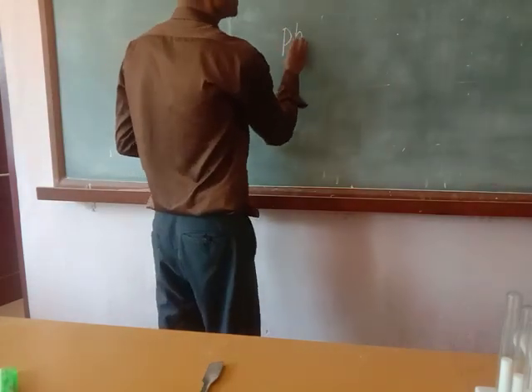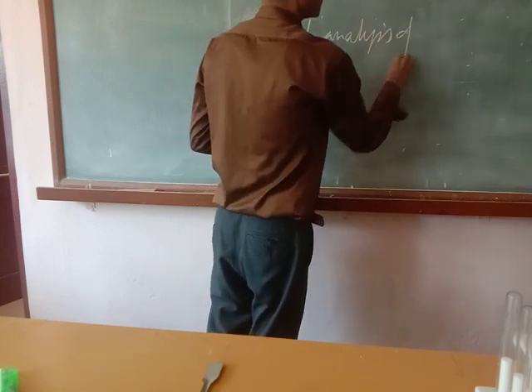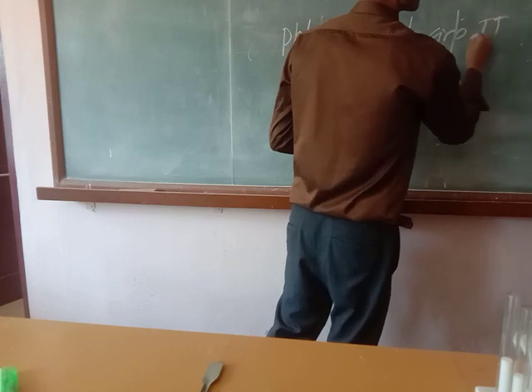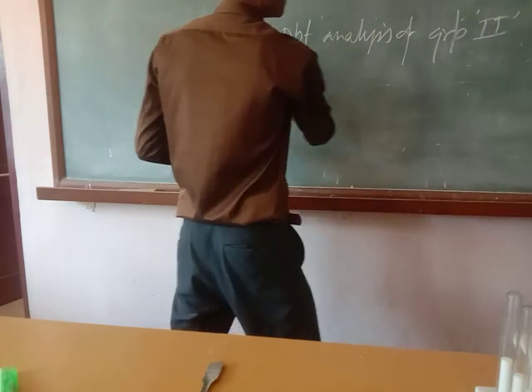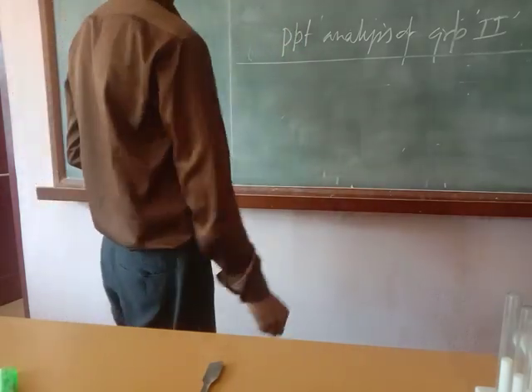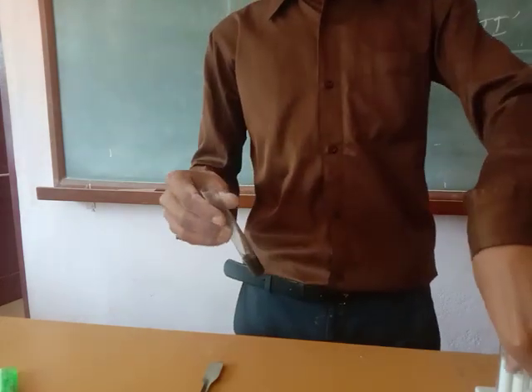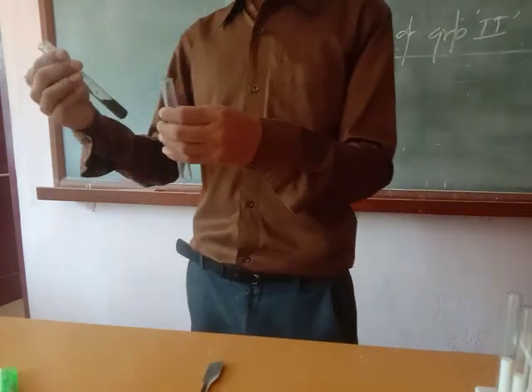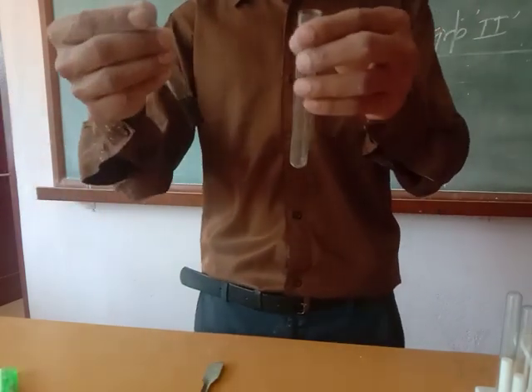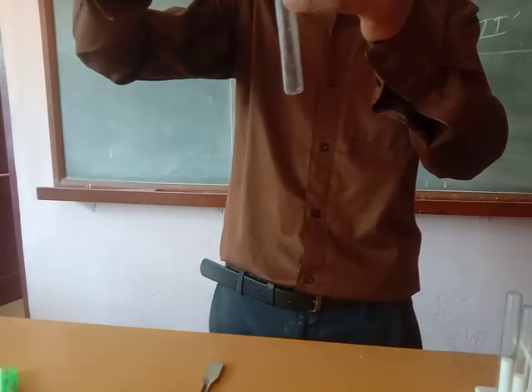Now we have to perform precipitate analysis of group 2. For precipitate analysis, you take the black precipitate.